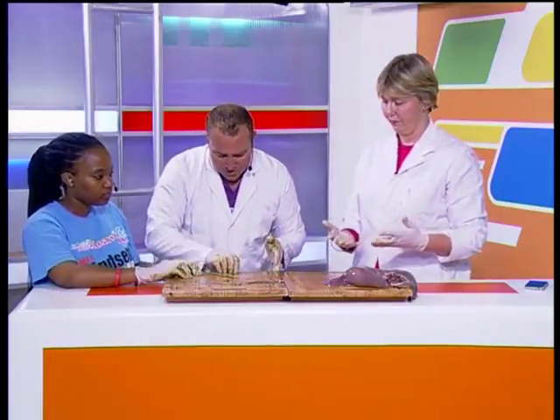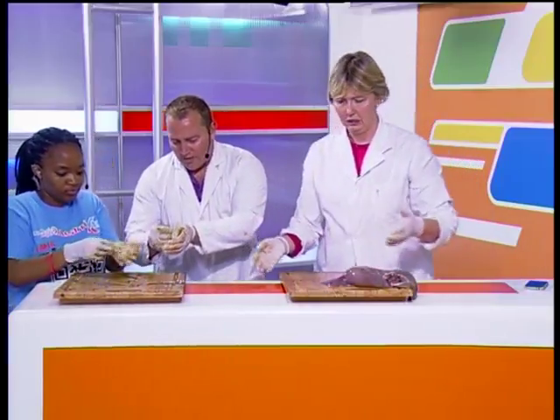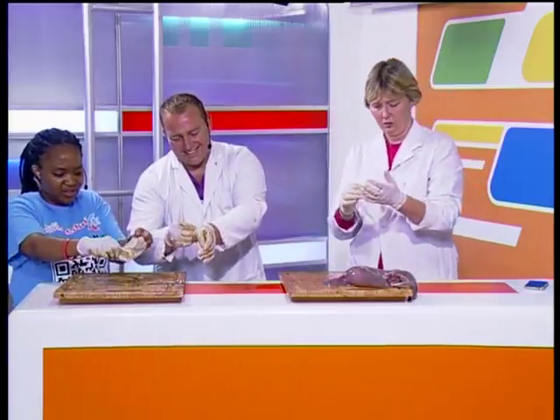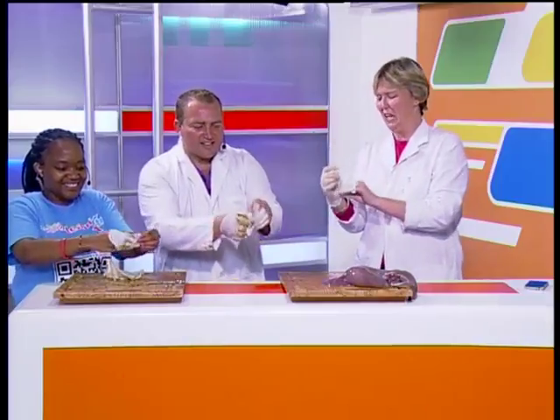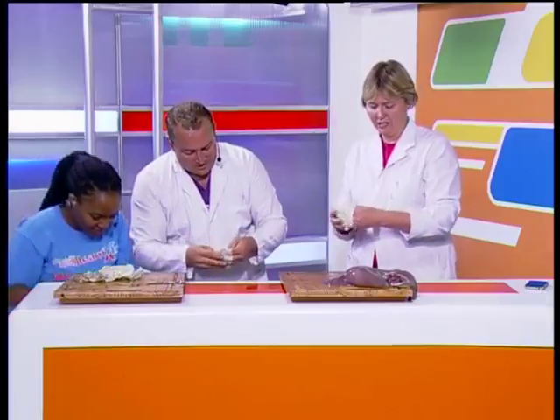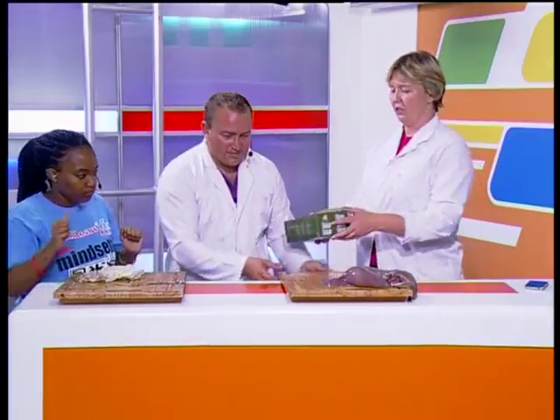What I want to do is move this over, away from poor Looney. I want to change gloves. Yes, we all change gloves. I think that's a good idea, because you're professional. It's not that. It's that the stuff is nice and clean and it stinks, so you don't want to contaminate it. So chuck it on the ground. There you go, ladies and gents.